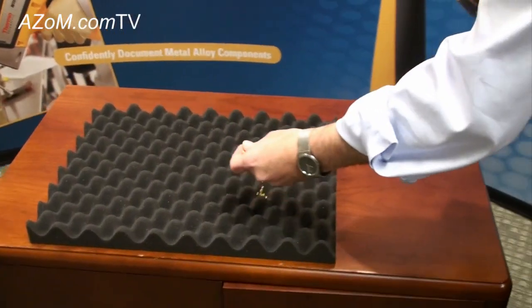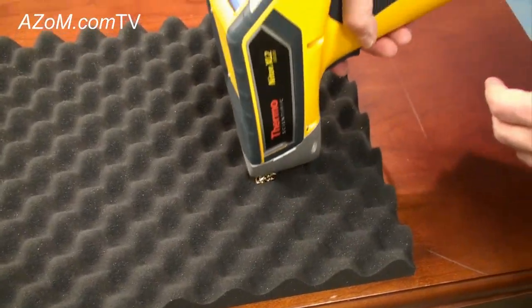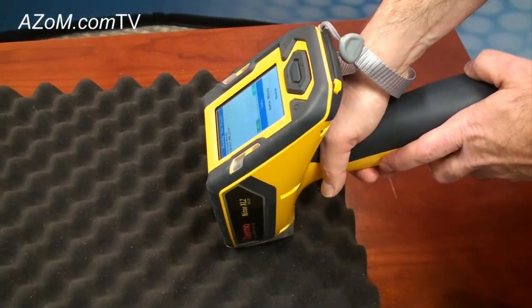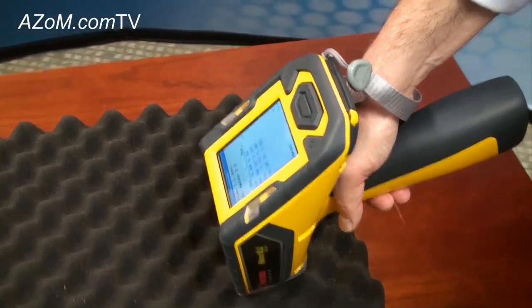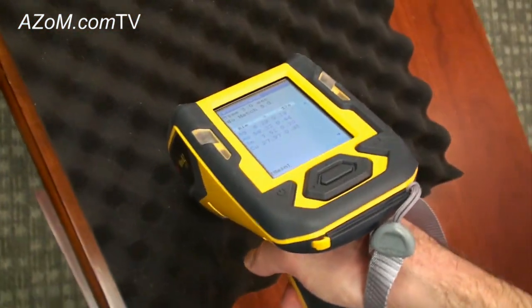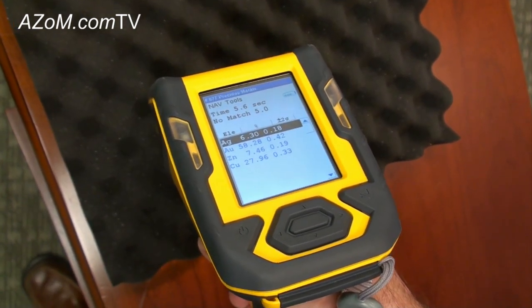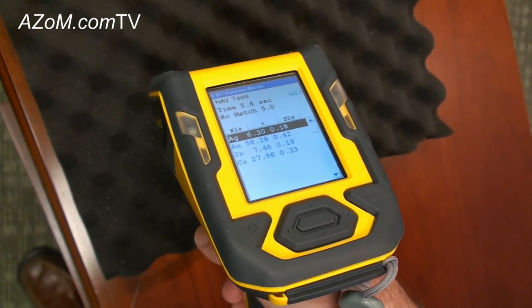First off, we'll measure a gold link bracelet. It's as simple as taking the analyzer, putting it directly on the sample, squeezing and holding the trigger, and in a couple of seconds we can see the results indicating that it's got about 58% gold, and that translates into 14 karat.